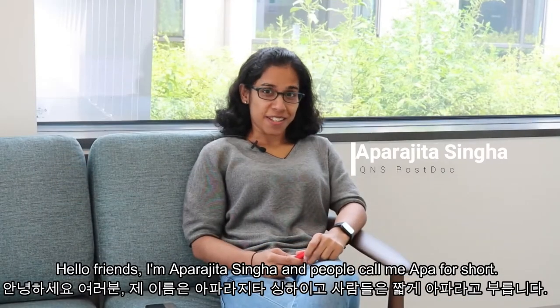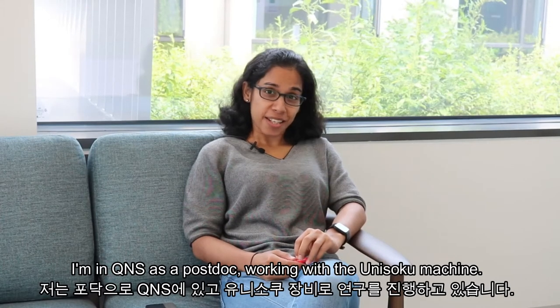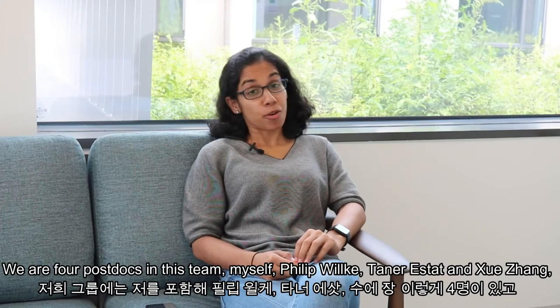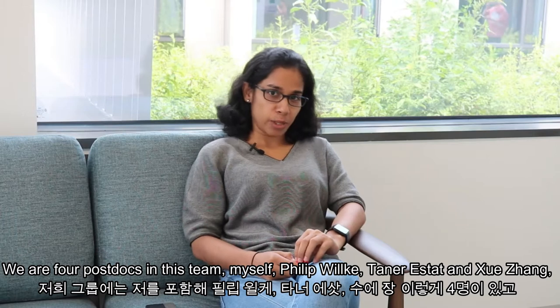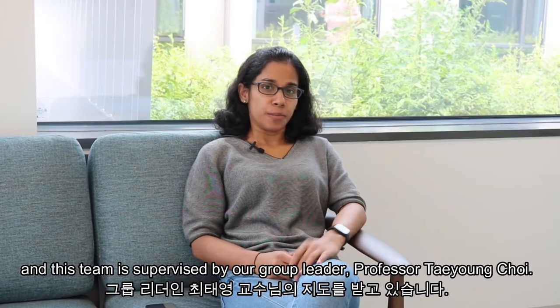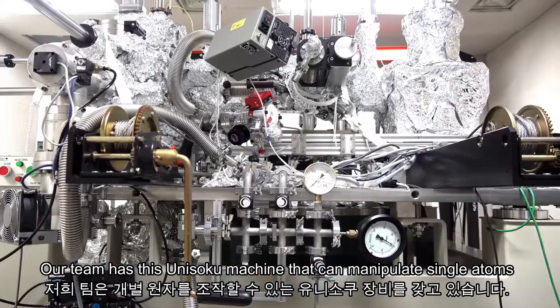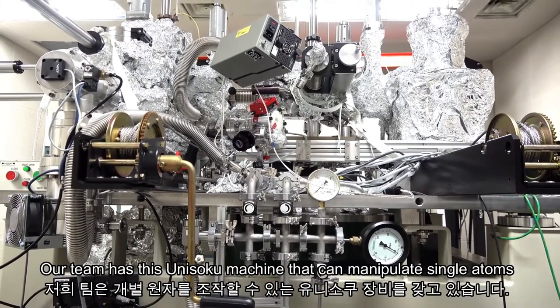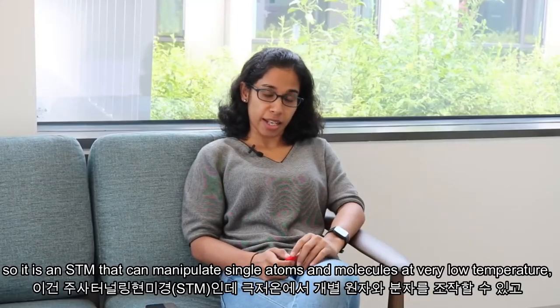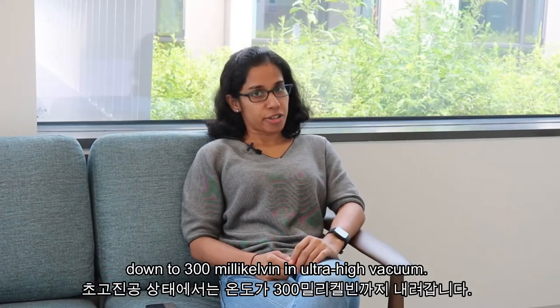Hello friends, I am Aparajita Singha and people call me Apa for short. I am in QNS as a postdoc working with the Unisoku machine. We are four postdocs in this team: myself, Philip Willke, Taner Esat, and Xue Zhang, and this team is supervised by our group leader, Professor Thean Choi. Our team has this Unisoku machine that can manipulate single atoms — it is an STM that can manipulate single atoms and molecules at very low temperature, down to 300 mK, in ultra-high vacuum.